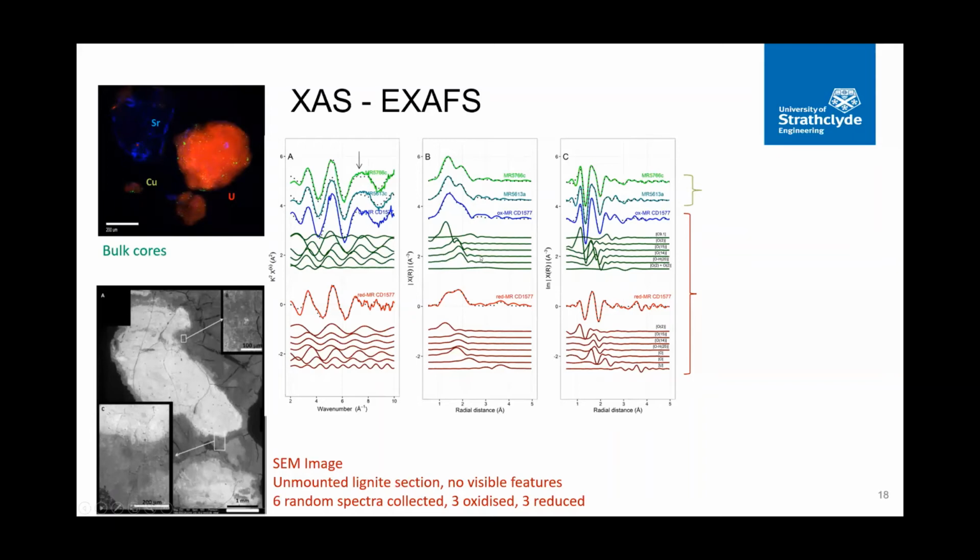I'll have to give credit: I worked with Barbara Etchman, who did a lot of work in fitting these spectra. For the top two, we see there is no uranium shell here, which you would normally get in this region. This is all oxide, but we get a few small elements in this area, concluding that a uranium carbon compound could fit here. Other features we observe are similar to what Melissa Denecki found when she was working with humics and uranium. You get a broadening of the peak in about the same region. That's just a characteristic, and I'm not sure what that means.